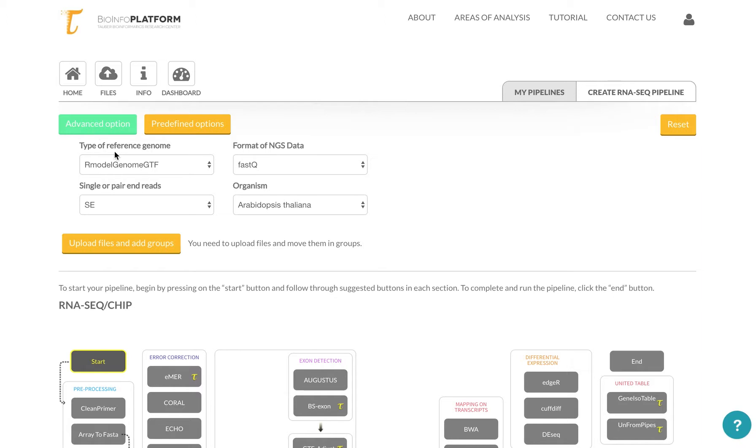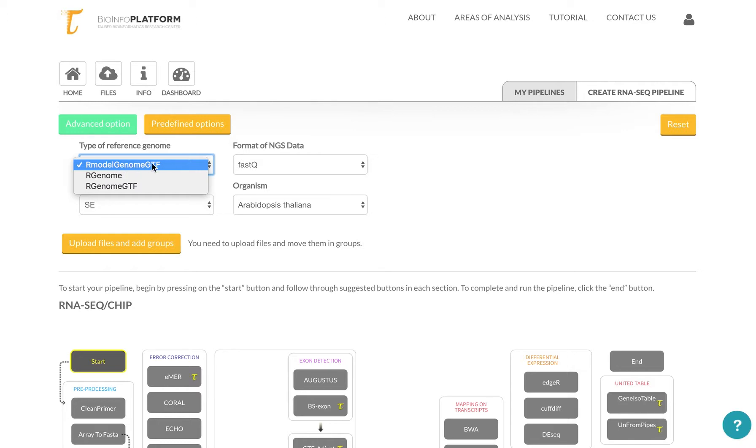Under the advanced options, you will see that you have a few types of dropdowns that help you determine what kind of data you're uploading. So you have a model genome with a .gtf file with an annotation file. You might have a genome that you want to upload yourself, and you might want to upload an annotated genome that is not contained in our section under organism over here.